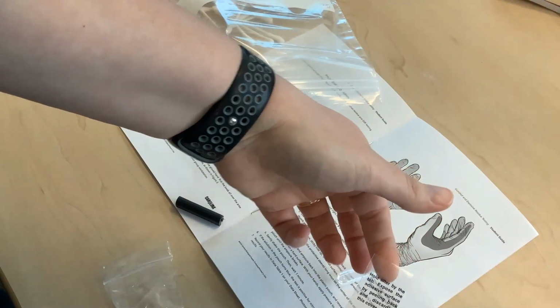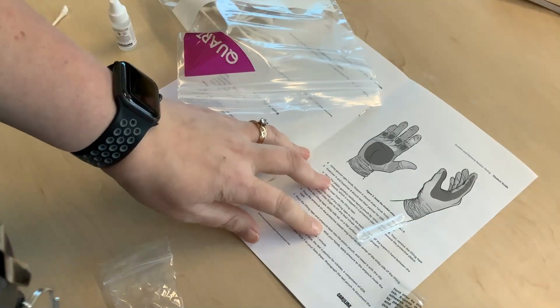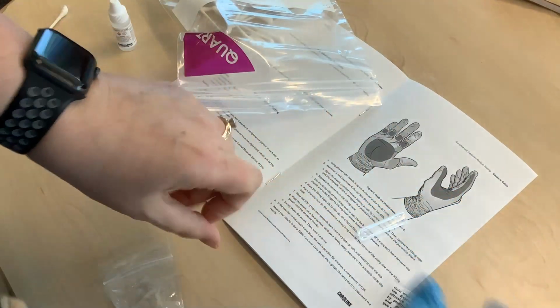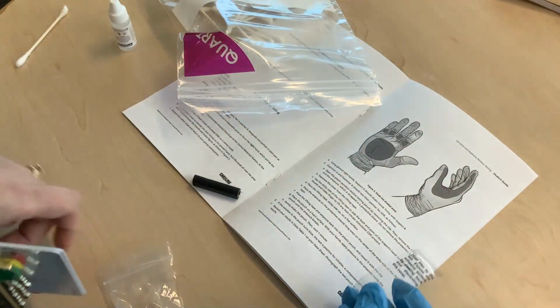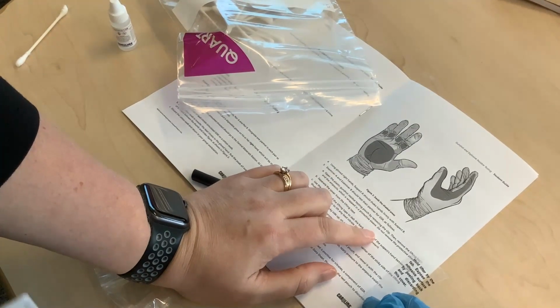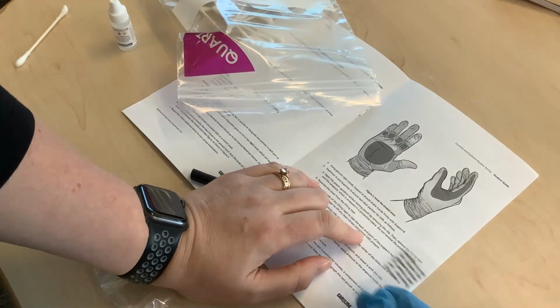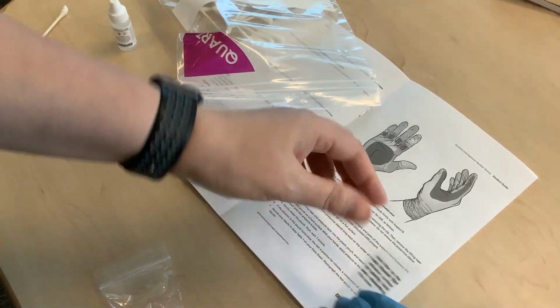So this is the part of the tape, and there's a plastic covering on it right now that you are going to use to lift that nitrate. It says you're going to open the pouch. You're going to remove the clip. Do not remove the protective sleeve from around the vial. You're going to separate the cover from the lifting tape.